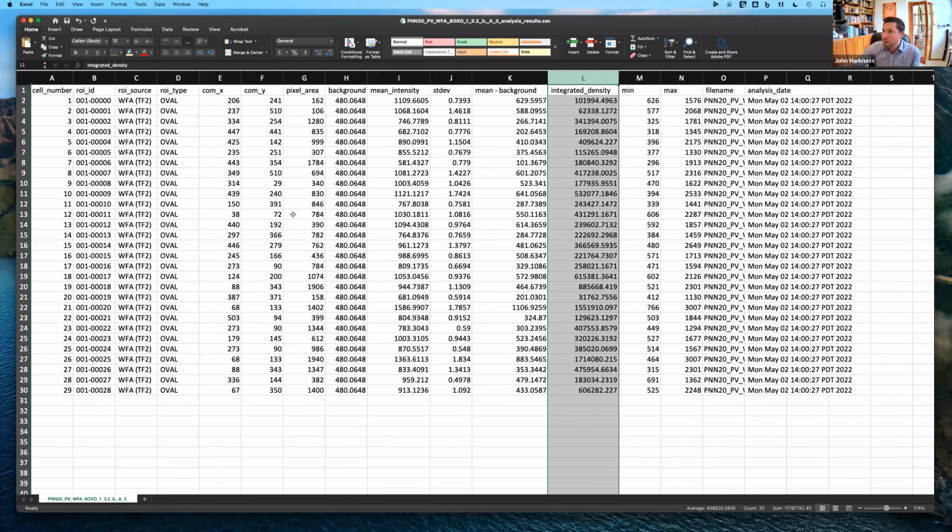But hopefully from this Excel sheet, you should be able to move to stats pretty quickly, and start getting to the end of your project, because I think the last thing any of us want to do is spend a whole bunch of time doing the image analysis as you're trying to get a paper out. So that's pretty much what we're seeing there.